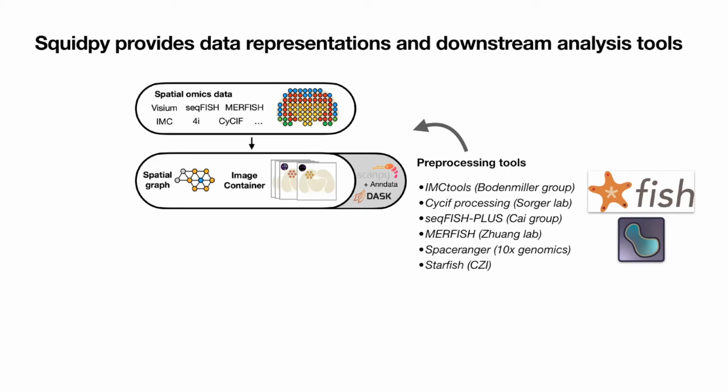For example, you could use these tissue images to segment the cells. In spatial transcriptomics, where you have spots with many cells per spot, maybe 10 cells per spot, you could segment and count the cells per spot by leveraging the H&E stained tissue image. And this is something you could do in the Squidpy framework.